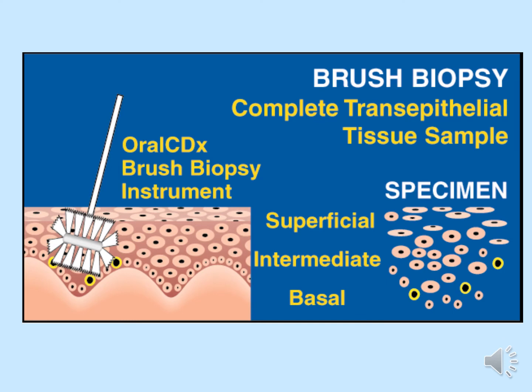So this is the diagrammatic representation. Basically the brush is scraped onto the epithelial cells on the mucosa, and the mucosa here is showing cells that have different sizes of nuclei and different grades of chromatism, all indicative of abnormality in the epithelium. These cells get attached to the bristles, and when you spread them onto the glass slide, these cells appear flattened out like that. However, despite that, we are okay.